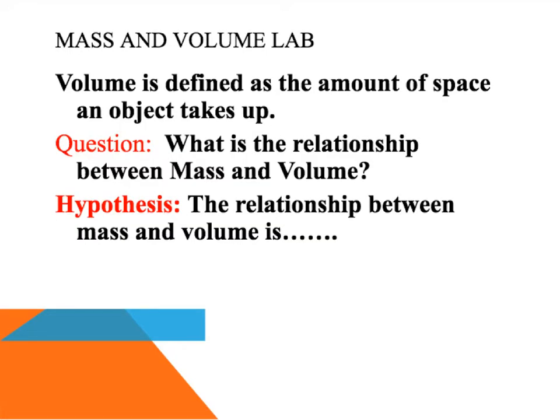Okay, so volume. Previously to this lab, we have done a couple labs that involved finding the mass of a substance. And we said that the mass is the number of particles in a substance. So the more particles something has, the greater the mass. Well, now we're going to start looking at the volume. Volume is the amount of space an object takes up, whether you're talking about a liquid, a solid, or a gas. All of those three phases of matter have volume. They all take up some amount of space.